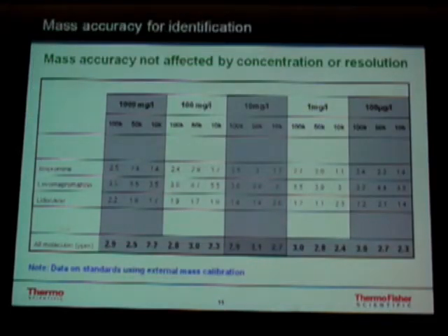Now what this slide shows is that mass accuracy is not affected by the concentration or even by the lower resolution that we ran for these 40 drugs.